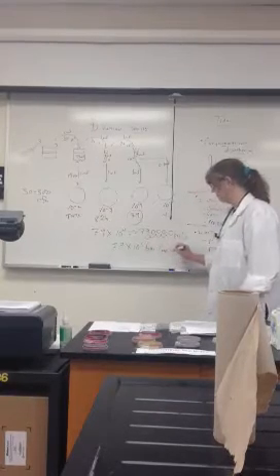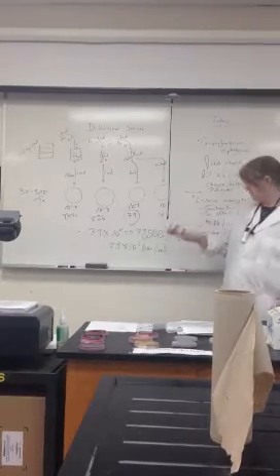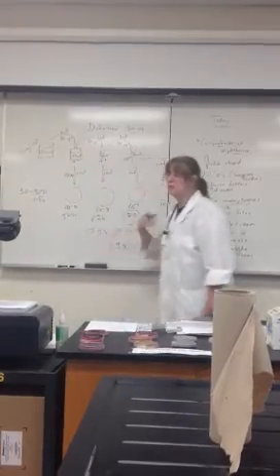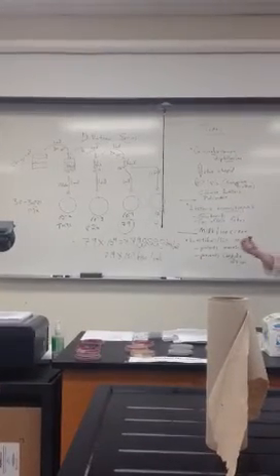What is this number? What have you discovered? The original number of organisms per mil back in the original sample. It tells you how many organisms, how contaminated, what you need to think about in regards to the next step you're going to do, whether it's drink it, don't drink it, or sell it.